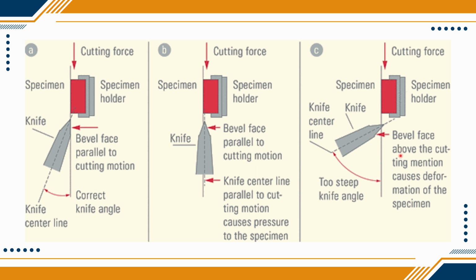And then another, if yung clearance angle nyo is too steep and masyadong manipis ang inyong rake angle, then ang tendency is you're just going to push the specimen block out of the cassette holder. Yun yung nagiging problema. So again, ideally, the clearance angle should be around 0 to 15 degrees, whereas the bevel angle is typically 35 degrees.